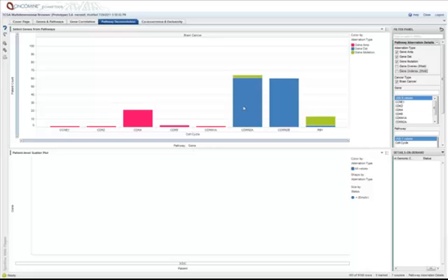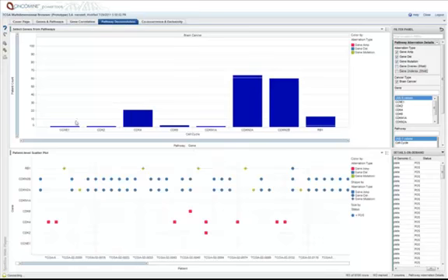Rarely we get mutations in CDKN2A, mutations in RB1, more rarely deletions in RB1, and then also amplifications in CDK4, but in other cyclins and CDKs as well. To examine the relationships among these alterations, we simply select them. And now again, we have a patient-by-patient view. Each patient is a column here. And we're simply coding the patients for the alterations that we've selected.